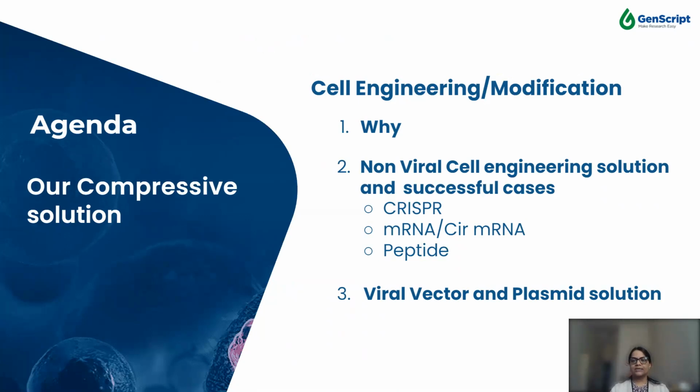In cell therapy, after cell isolation, activation, and expansion, a very important step is cell engineering or modification. The effectiveness and safety of CAR T cell therapy can be improved by using engineering strategies, where genetic material is delivered to the cell through a vector, which can be either viral or non-viral. Each type of vector offers a distinct method of introducing genetic material into the cell.